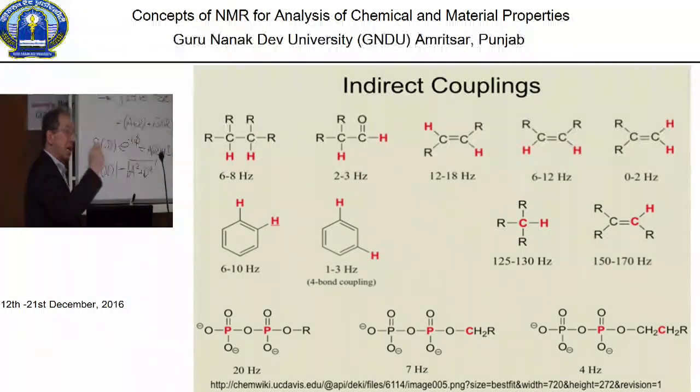So also the J couplings bear chemical information. So the chemical analysis focuses not only on the value of the chemical shift and the multiplet splitting in terms of how many lines and what amplitudes, but also in terms of the width of the splitting, of the separation of lines in the multiplets, which gives you the J coupling.